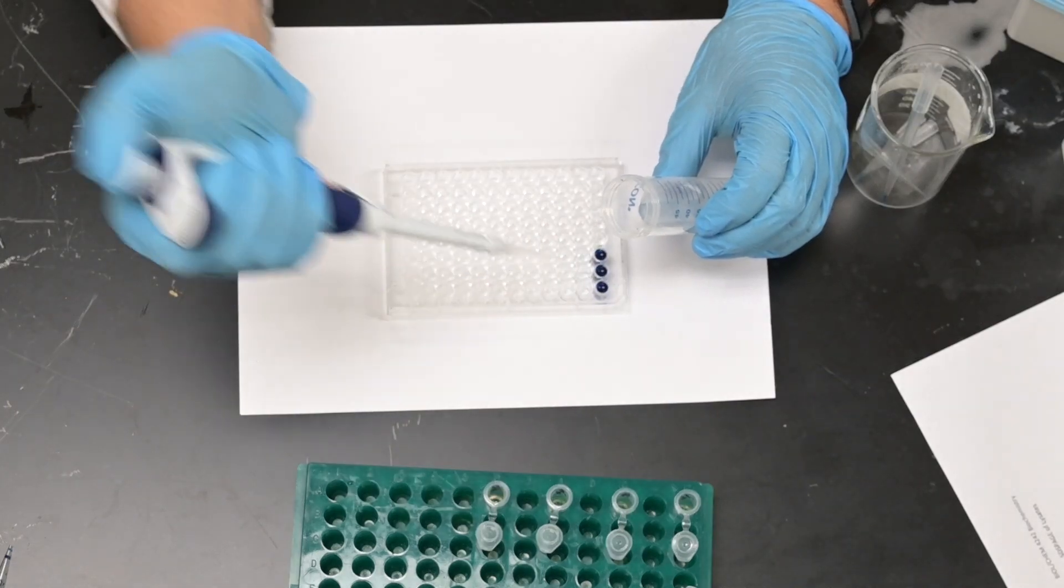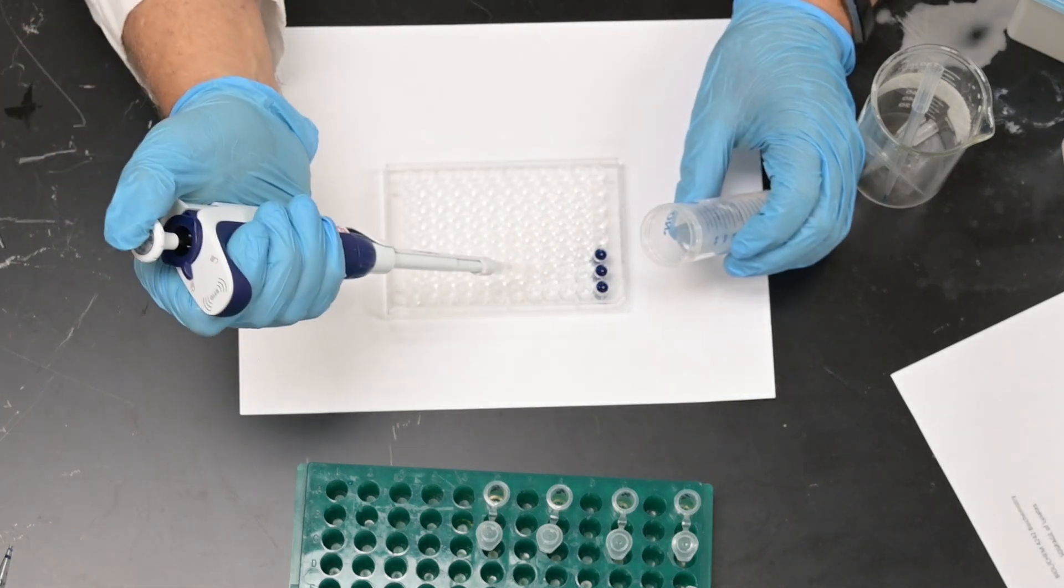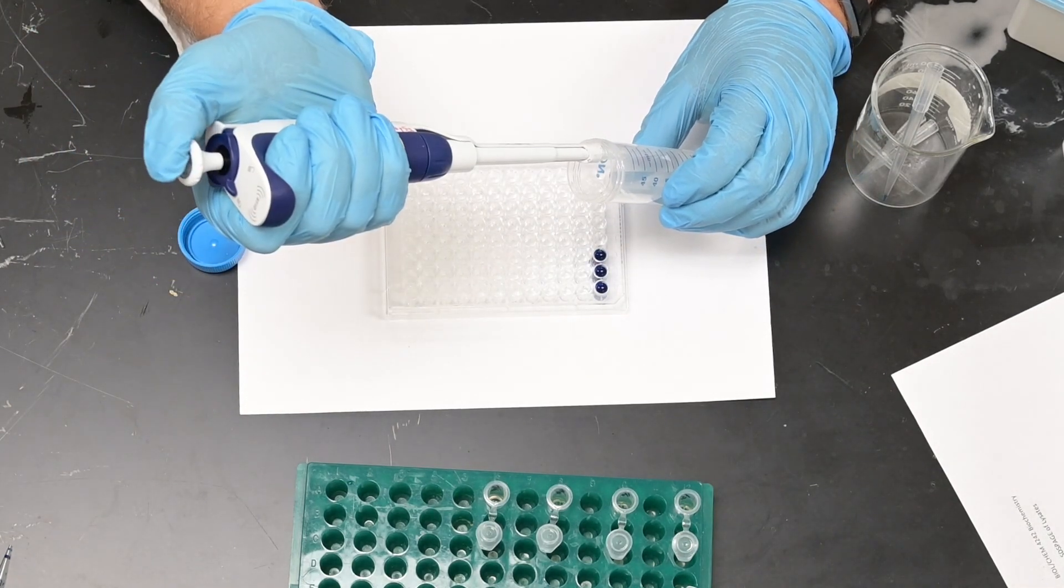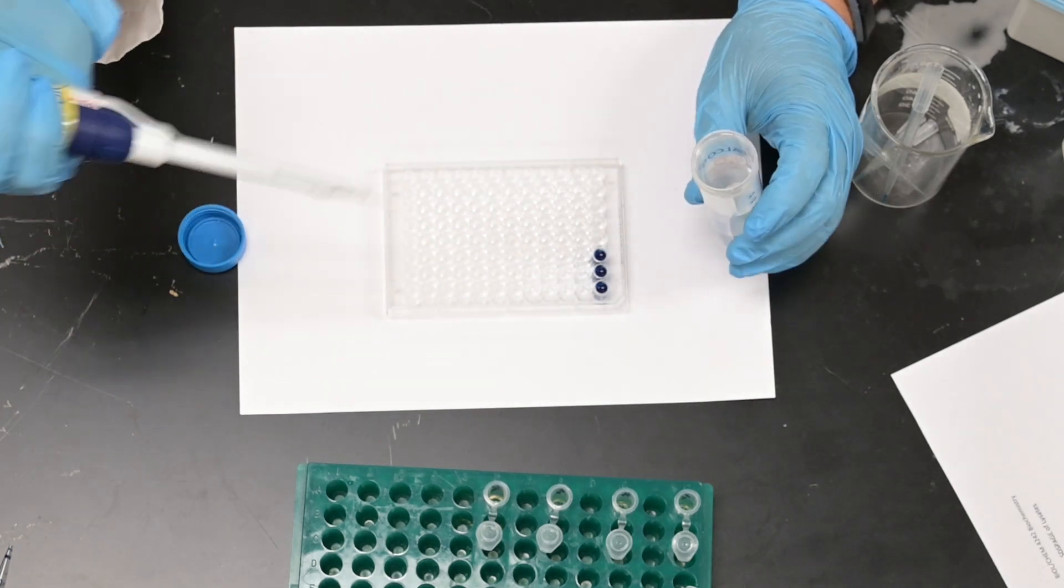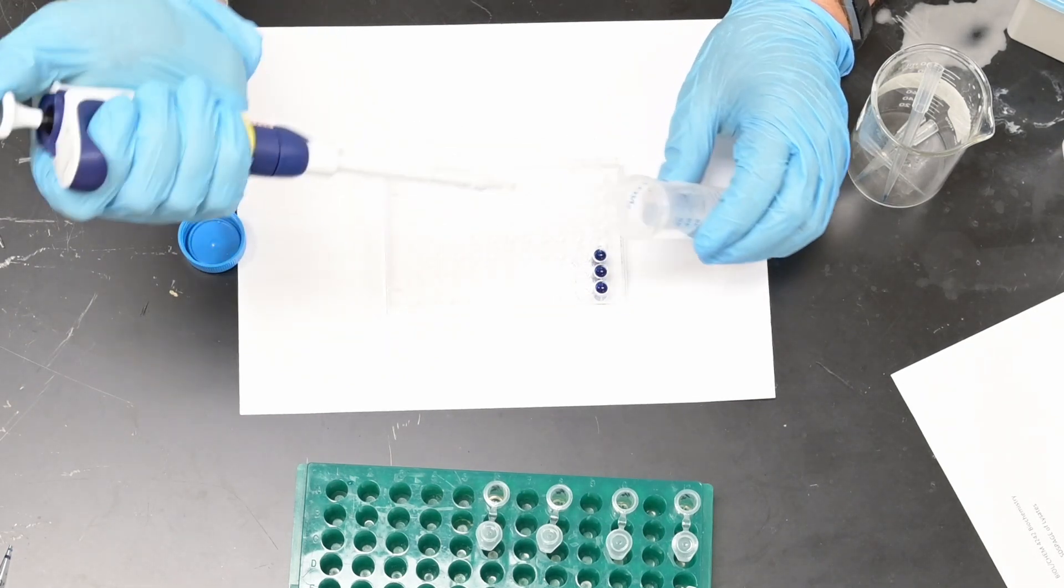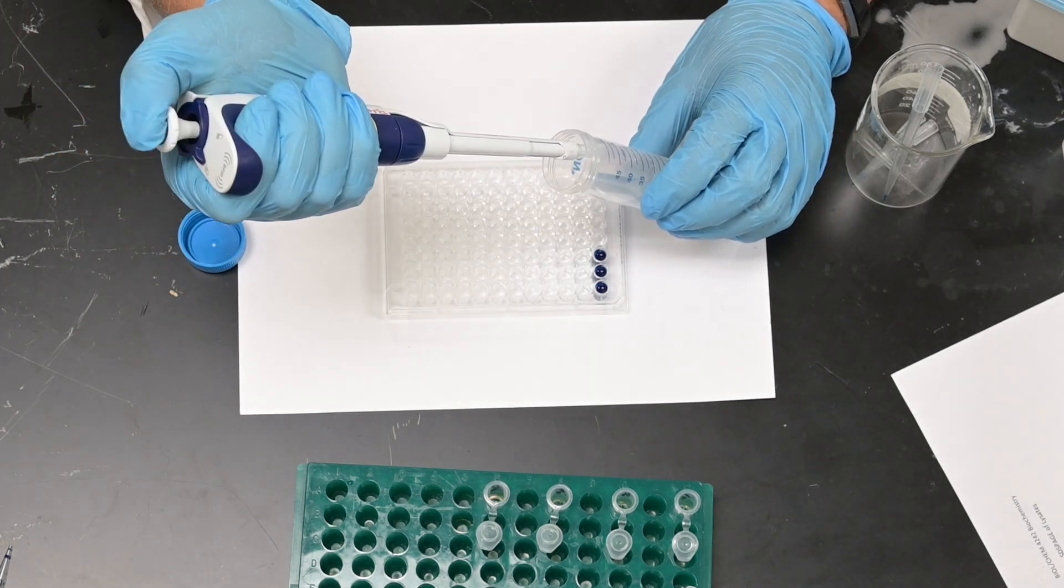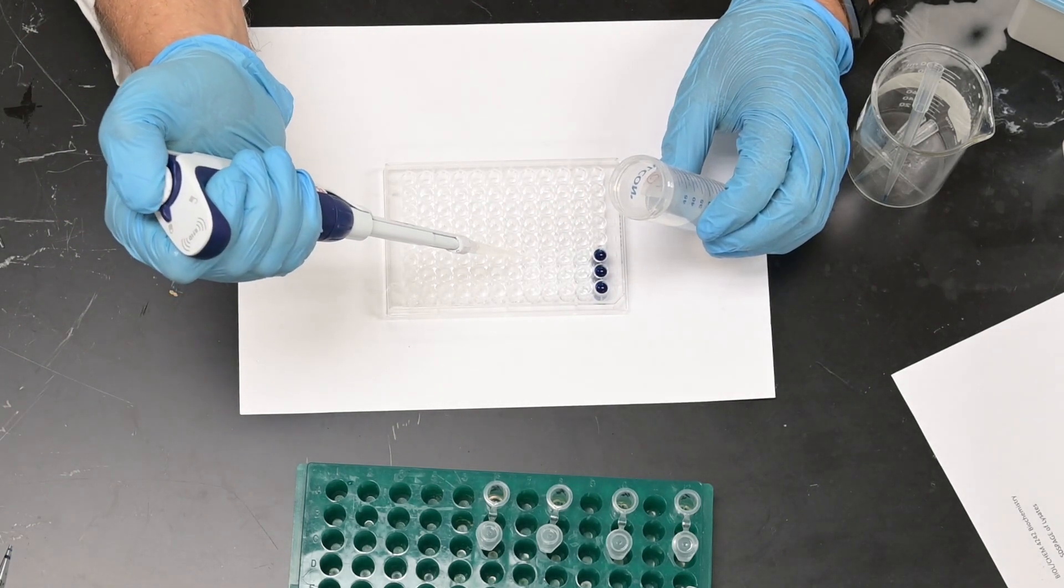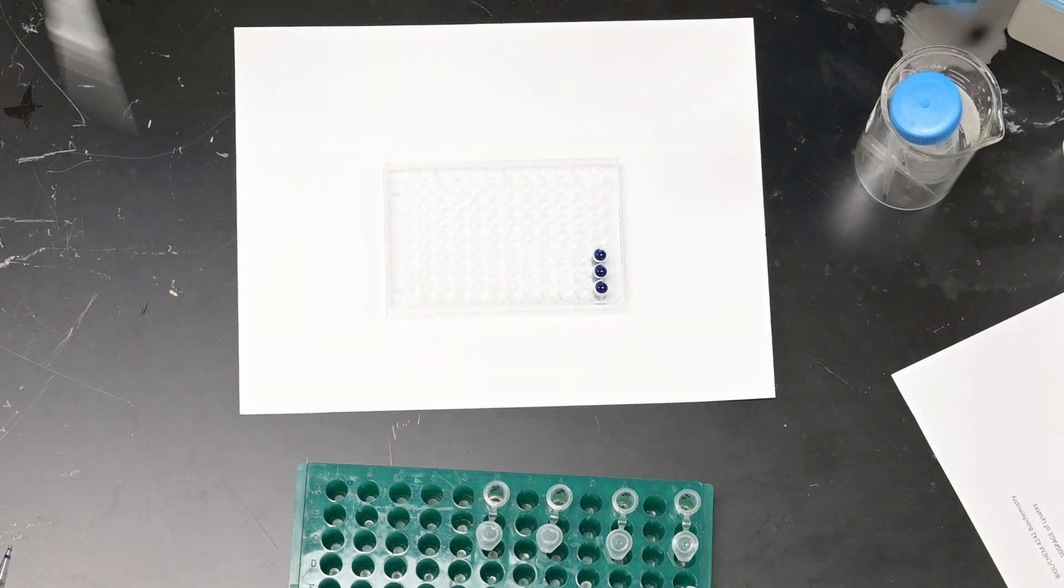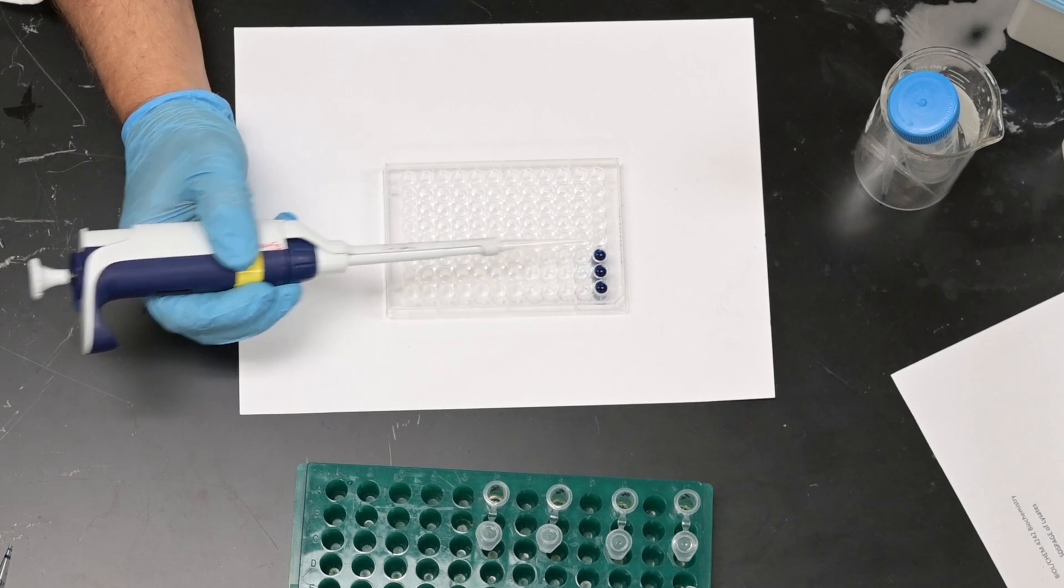What I found doing serial dilutions is I always start from higher dilution to lower dilution, even though it doesn't matter which order I add these in. So now I have the plate where there's 300 microliters of one percent blue dextran in column one A, B, and C. Now columns two through five have 150 microliters of water.